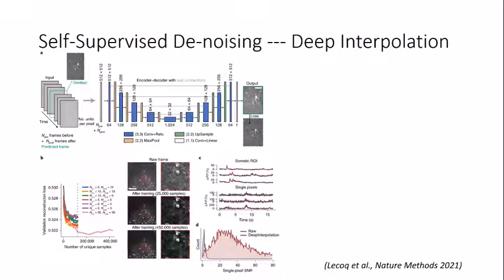And we also add Noise2Void on top of it, so that besides the frames before and after, the model will also take into consideration the frame itself and try to predict the blind spots that are chosen randomly, so that the spatial resolution is actually improved a little bit after this combination.